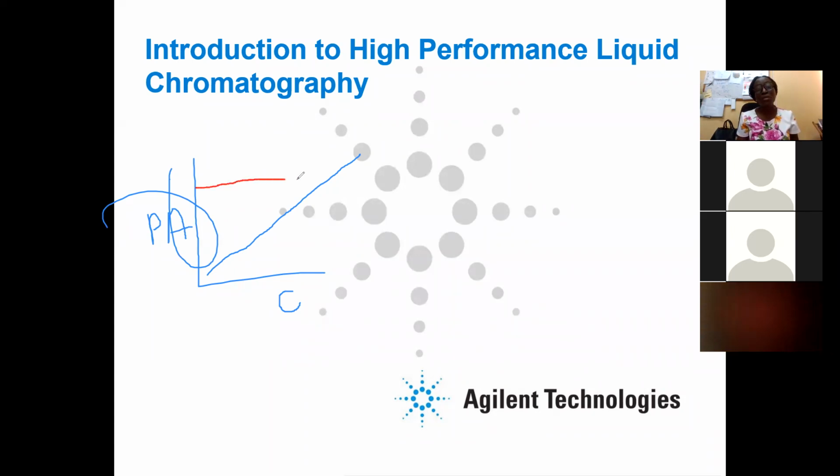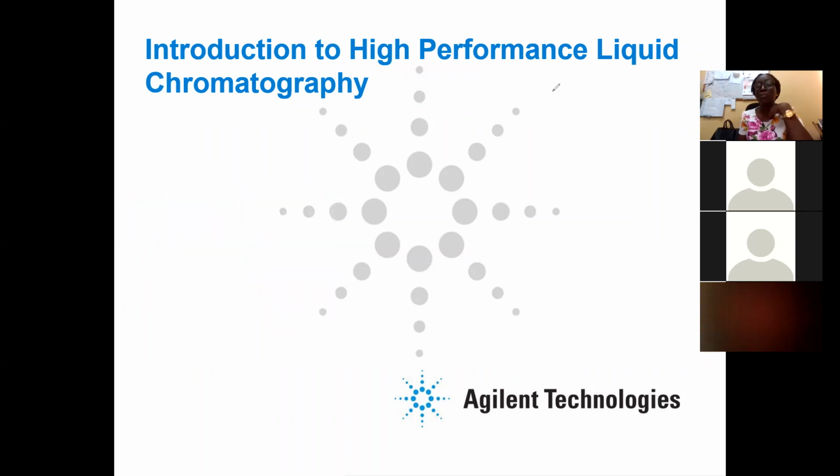So I will now extrapolate on this calibration plot and come down, and whatever I see here will be the concentration of my unknown sample. So in looking at what you have there, you always start with your known samples. The known samples will give you the peak area, and from there you can extrapolate the concentration of your unknown from the peak area that you already know from your sample.